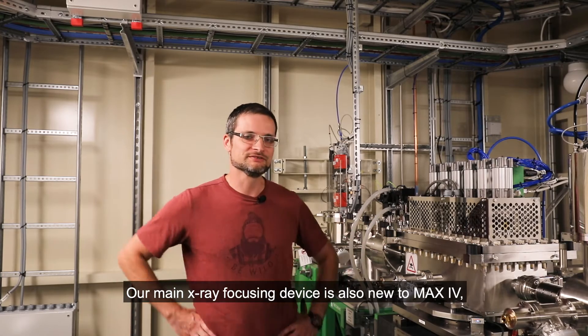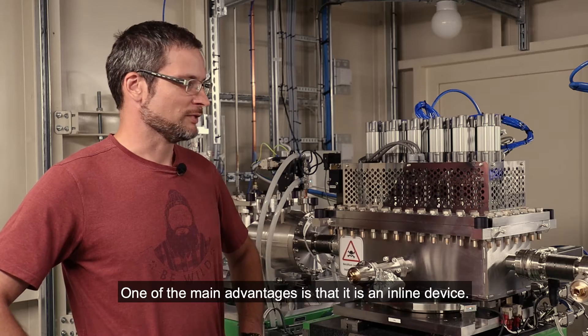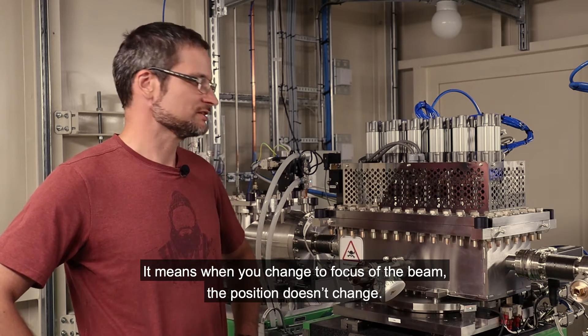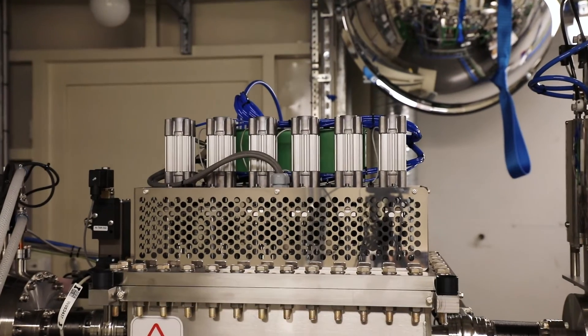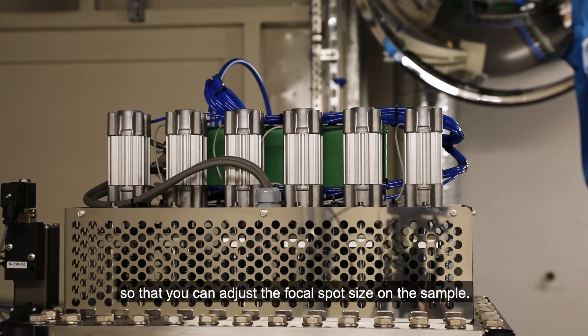Our main X-ray focusing device is also new to MAX IV because it's based on compound refractive lenses. One of the biggest advantages is that it's an inline device — it means when you change the focus of the beam, the position doesn't change. It has six different cassettes which you can insert in any combination to change the lenslets, so that you can adjust the focal spot size on the sample.